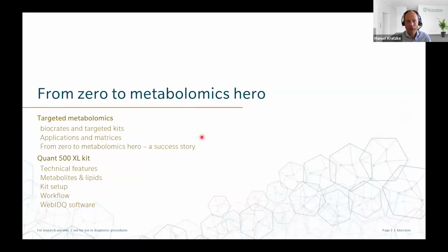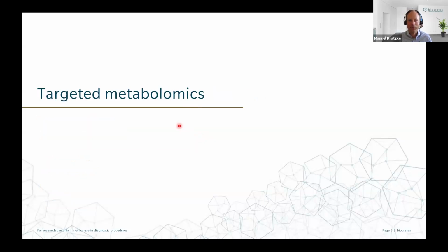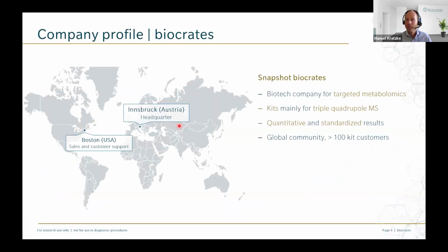And I will talk about two parts. So first we will have a brief look at targeted metabolomics and its applications, and then we will focus on one of our kits, the Quant 500 XL kit. So let's get started with targeted metabolomics.